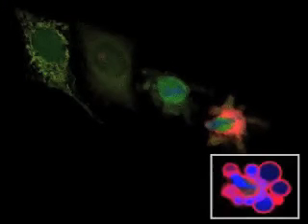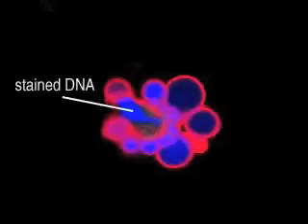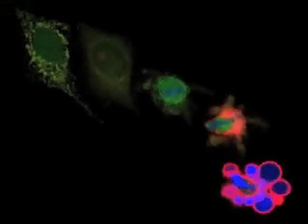Finally, although apoptosing cells don't lyse, their plasma membranes do become permeable to small molecules. This event has been visualized here by adding a dye to the media that fluoresces blue when it can enter cells and bind to DNA. All 3 of these events can be observed in the same group of cells.